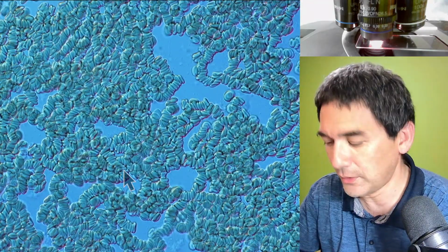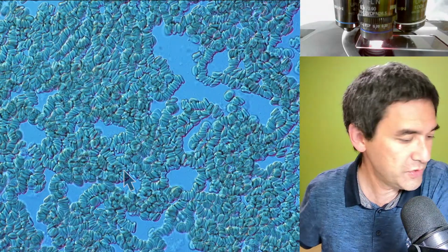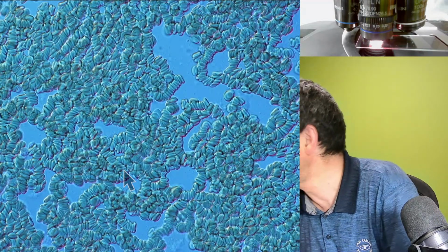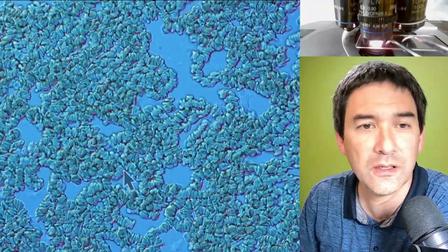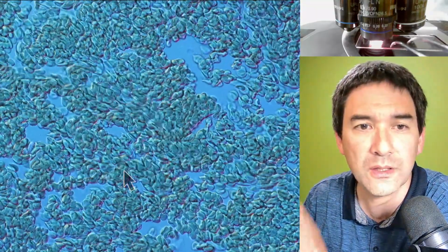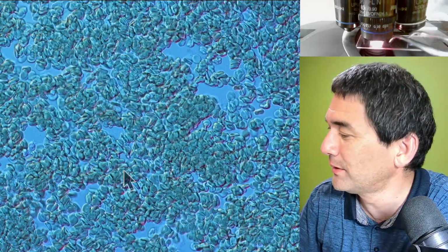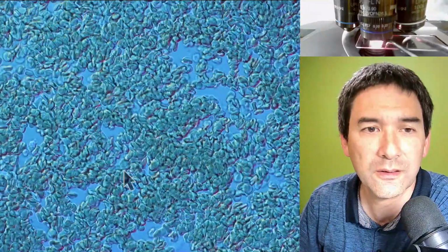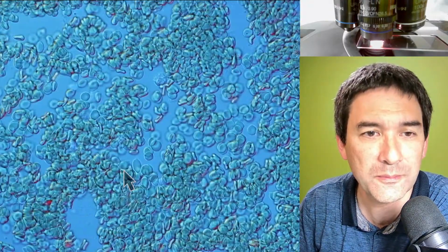You know what I would like to try now? I would like to press against the microscope slide to see how this is actually. See, when you press, you see how the blood moves. When you do that, you're also starting to break up the stacks of cells a little bit.